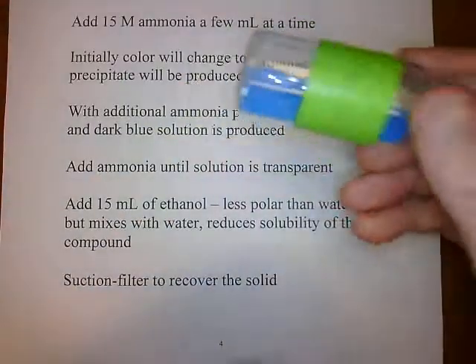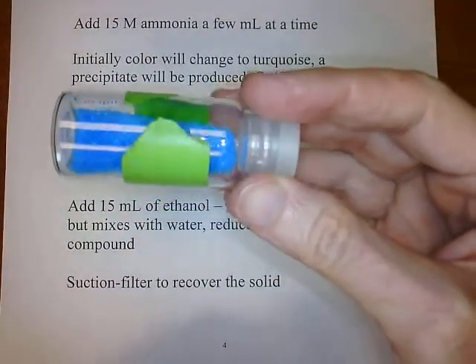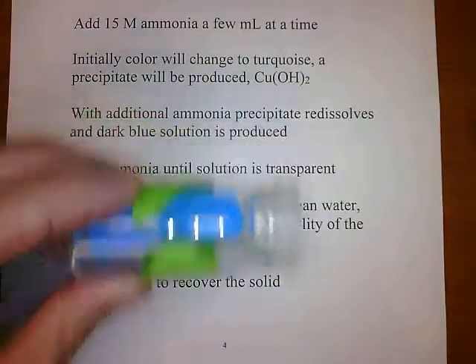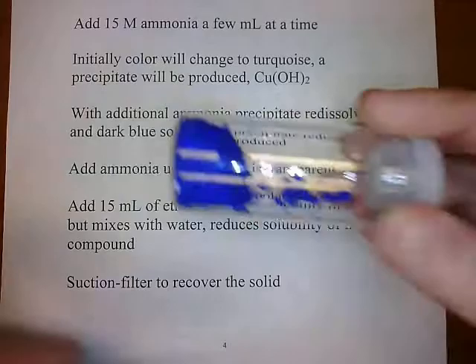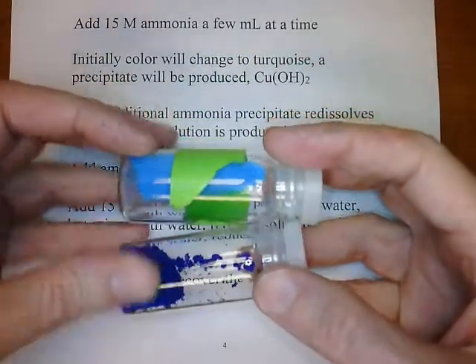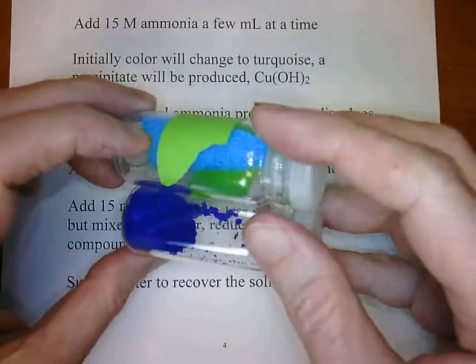Let's compare the color to the copper sulfate starting material that we started with. The copper sulfate pentahydrate looks like this. This is the compound that we're making. If you want to see the two side by side.